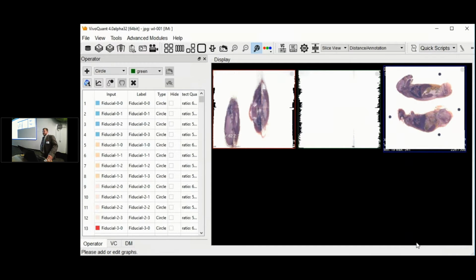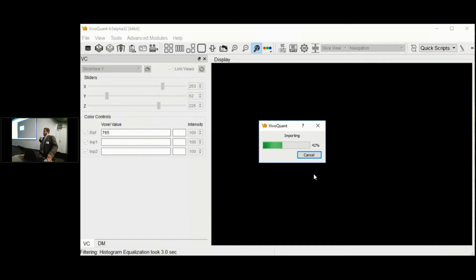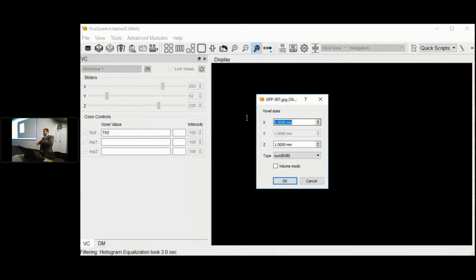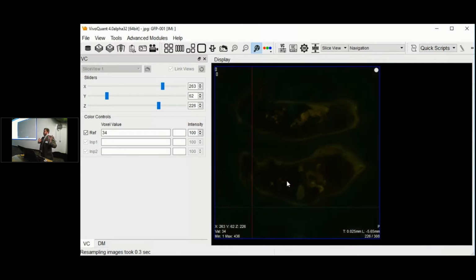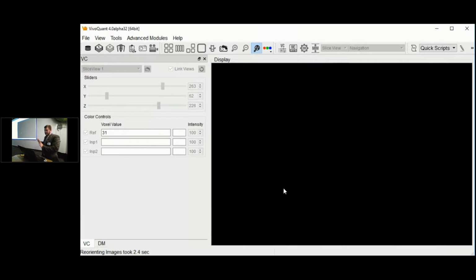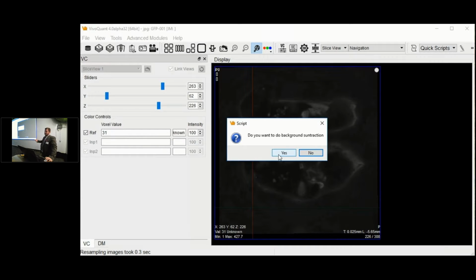In this case, the white light images were taken with the same camera as the fluorescence images, so they are natively co-registered to each other. That's how we get overlays for free. But we still need to take the alignment transforms from the white light images and apply them to the fluorescence images. So we load the fluorescence images, and we perform the alignment.